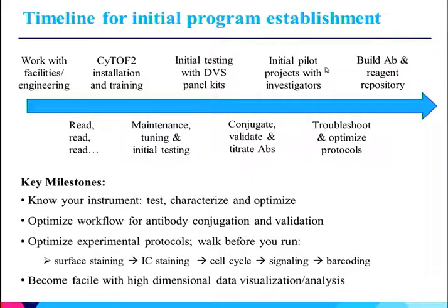And really these, and also troubleshooting and optimizing the protocols associated with using these reagents. And a lot of this is actually fairly fundamental. I mean, I'd done flow cytometry for 10 years, and it still took me a while to realize that fixation conditions for the CyTOF are quite different. And if you don't fix your cells properly, your data is garbage. So there's a lot of small things that need some tweaking as you're at this phase.